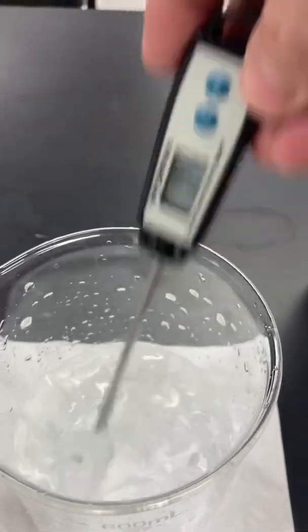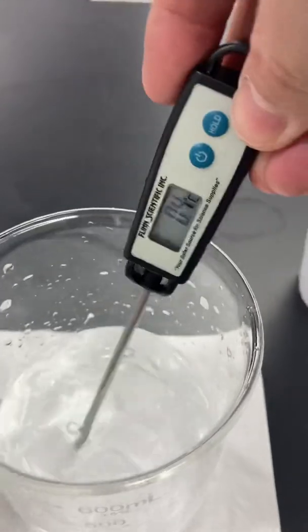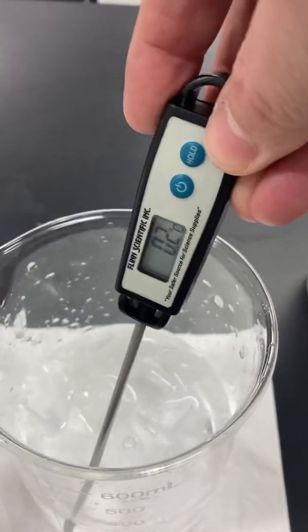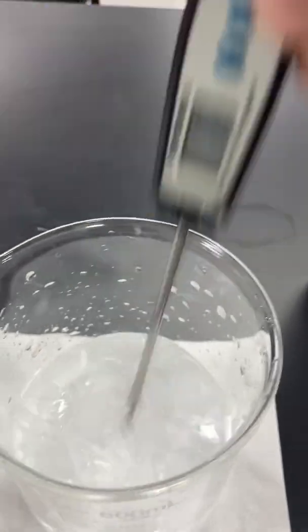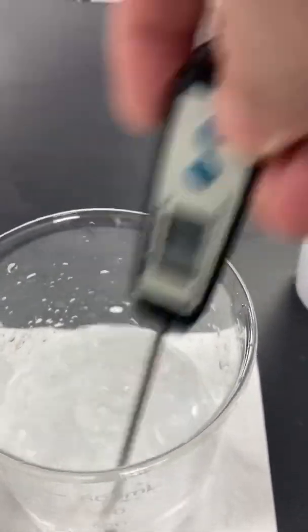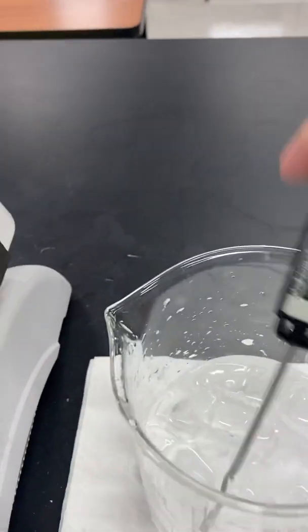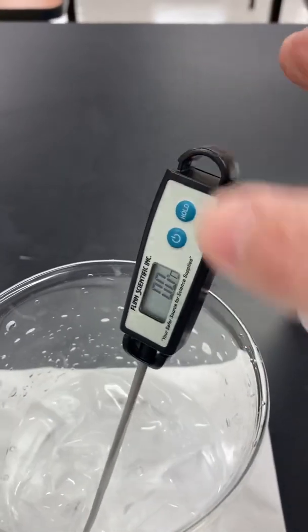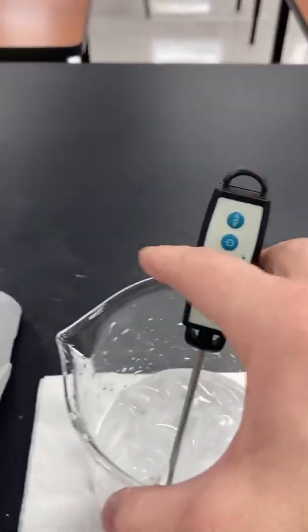Okay, in this video, I have about 300 milliliters of ice water, and I'm trying to stir it to get an initial reading here, and it looks like we're getting awfully close to 0. There we go, 0.1. So again, I have a mixture of ice water, and what we're gonna do is put this on a hot plate and start looking at the change in temperature. Oh, look at that, we got 0 degrees Celsius.